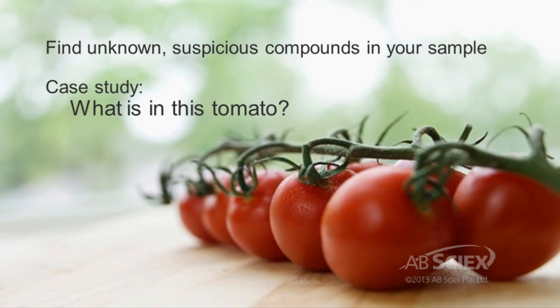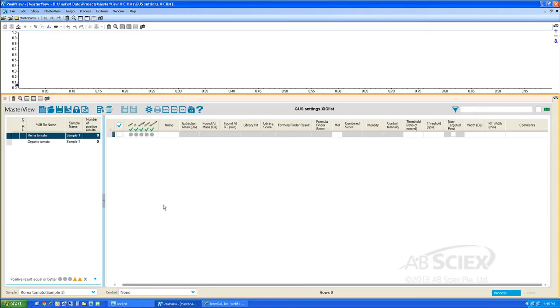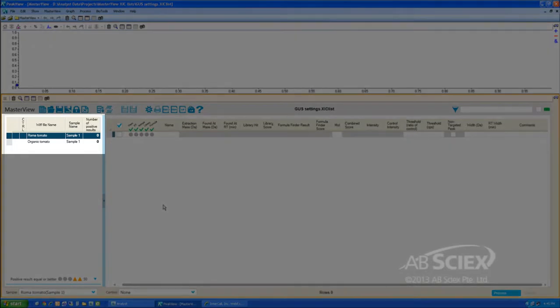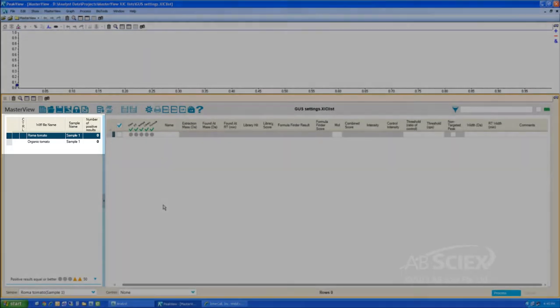MasterView software offers a great workflow to help find unknown contaminants in your samples of interest. In this example, we are analyzing for suspicious compounds or residues in a tomato sample. We first began by launching MasterView within the PeakView software, then opened our unknown Roma tomato sample and an organic tomato control sample.